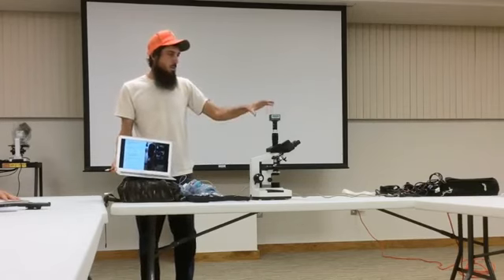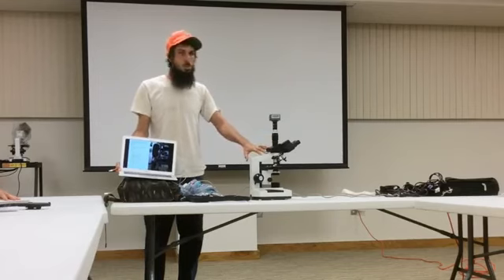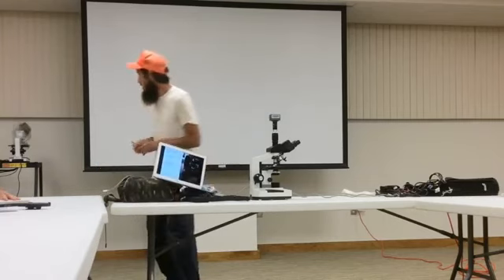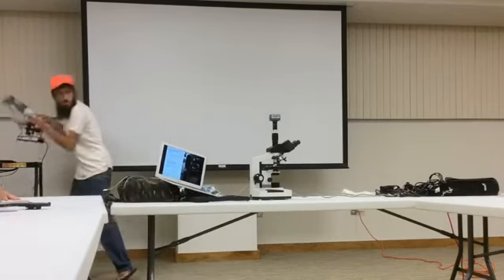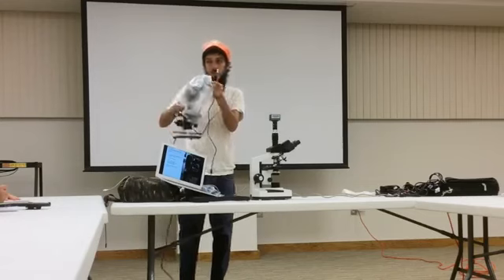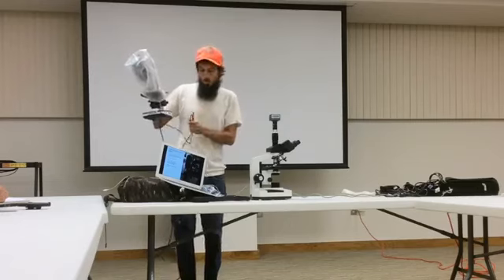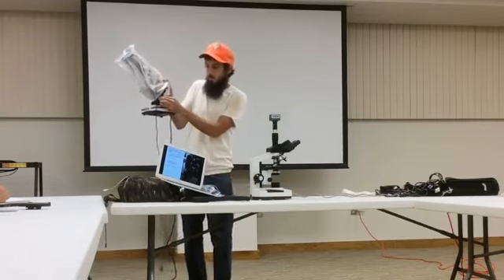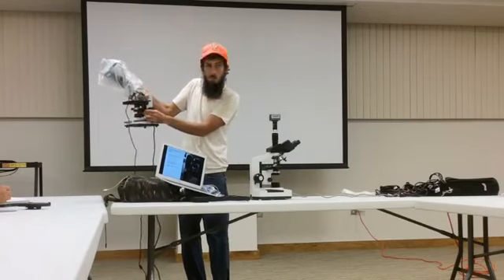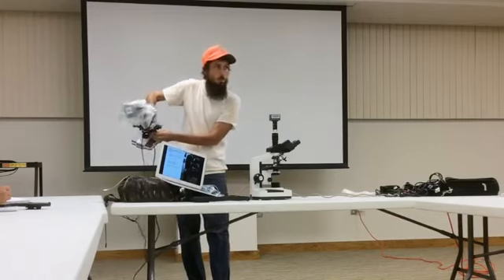These microscopes here run about $300 to $400. The other microscopes I just got for the school, and this was about 300, and then the camera was another 50 onto it. When you're looking for a microscope, another nice thing to have is that when I'm twisting this, the slide moves around, so it's real easy to track and find the organisms.